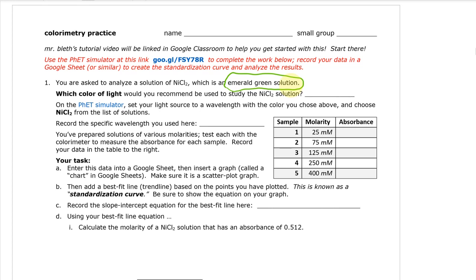It almost always has to do with a transition metal somewhere in the middle of our periodic table, and the valence electrons of that metal and how light interacts with it. I won't get into all that because I'm not qualified to explain exactly why the colors are what they are. But the colored solutions that we observe, in terms of salts like these, are typically related to a transition metal like nickel, copper, iron, lead, some of these sorts of metals. And as we look at the problems, you'll notice a repeating pattern of color related to those metals as well.